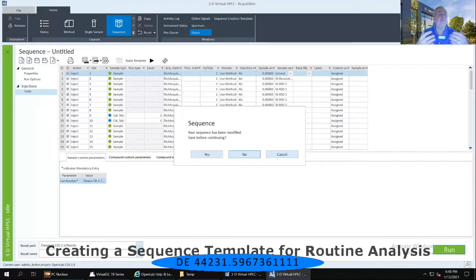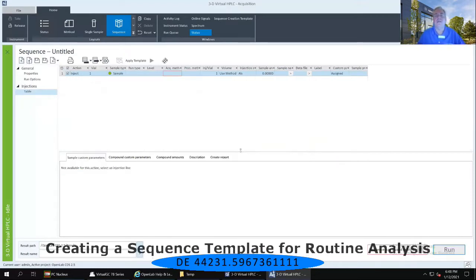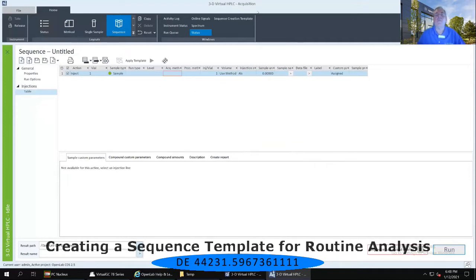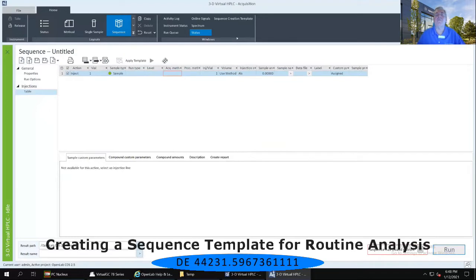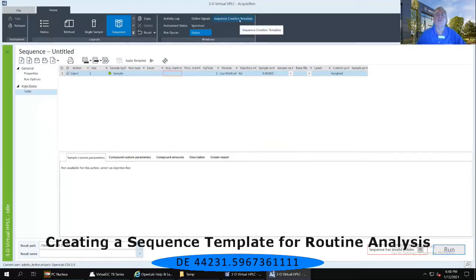I am not going to save my sequence — I'm going to say no, don't save it. And now in the upper black ribbon, I'm going to select the very last window in that Windows section. That's called sequence creation template.